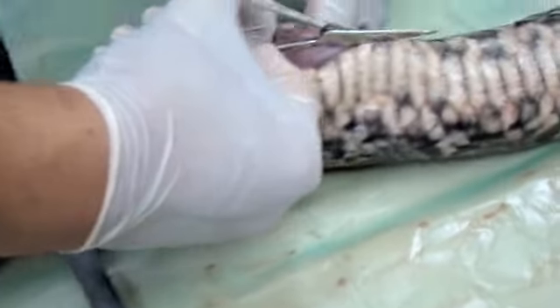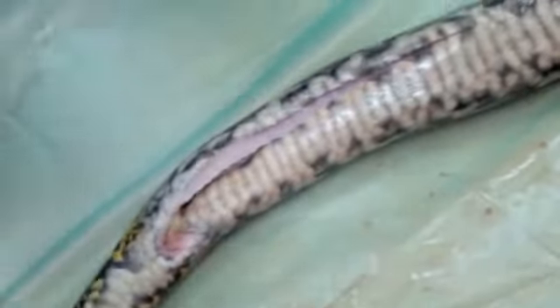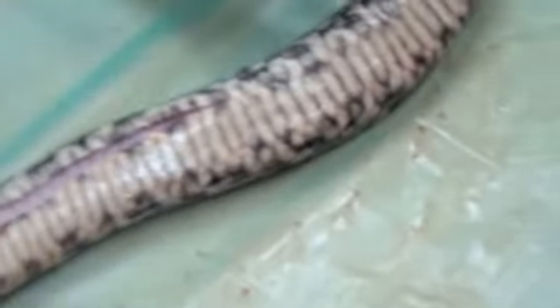All right, you're going to have lots of turns. Let them take turns with the meat. Who wants to cut? I want you to just take a turn, just take a little bit of time. We're just going to work on cutting, and then we're going to stop and open this section.